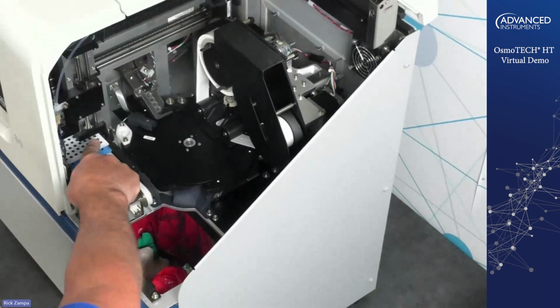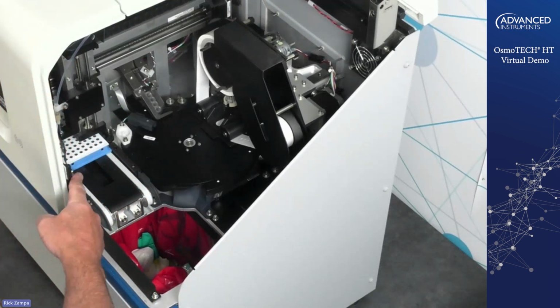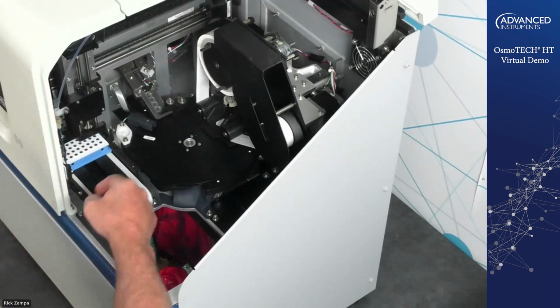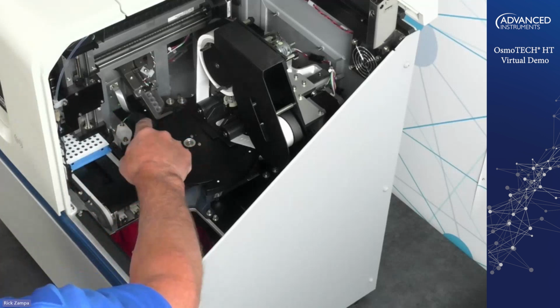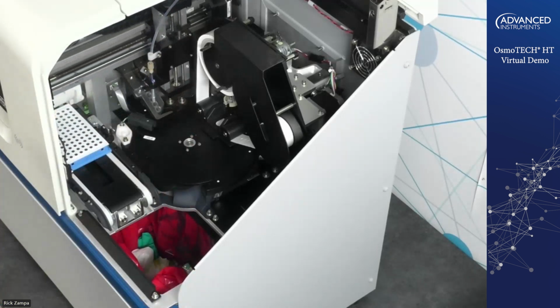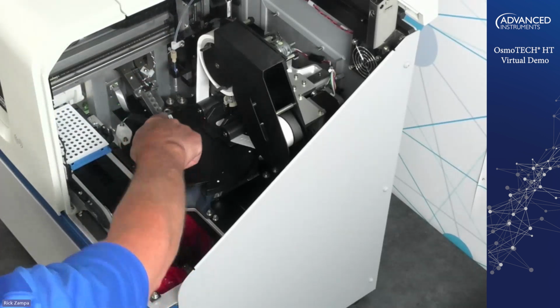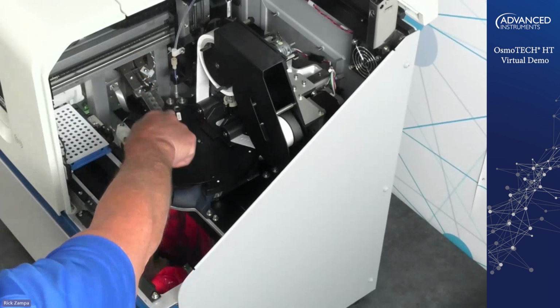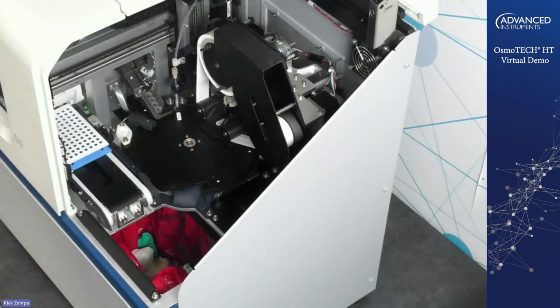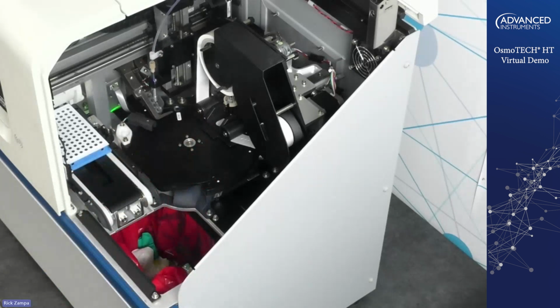We're looking in here. You can see the pipette over here is drawing the sample out of the well, or out of the 96 well plate. It's going to move over to the load position where there is a sample cup. You see the turntable turning, it picks up a sample cup. The pipette is going to dispense 20 microliters of sample into the sample cup. And then the turntable is going to move over to this position where the testing will begin.